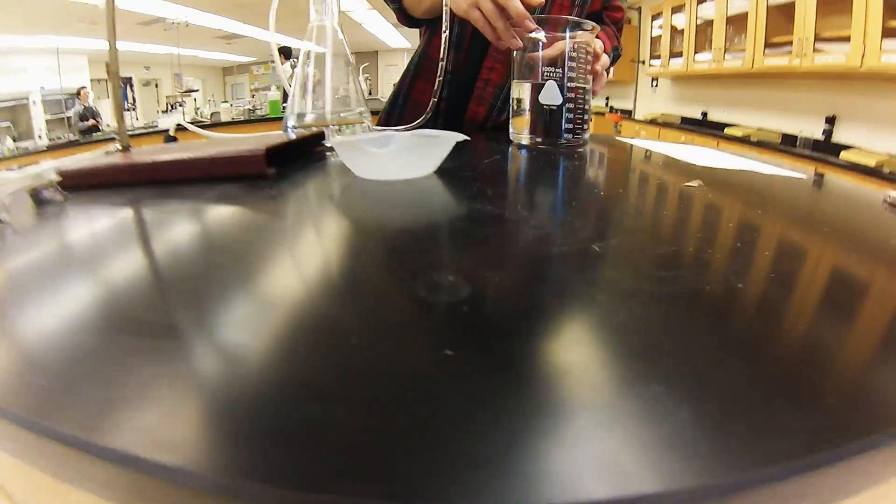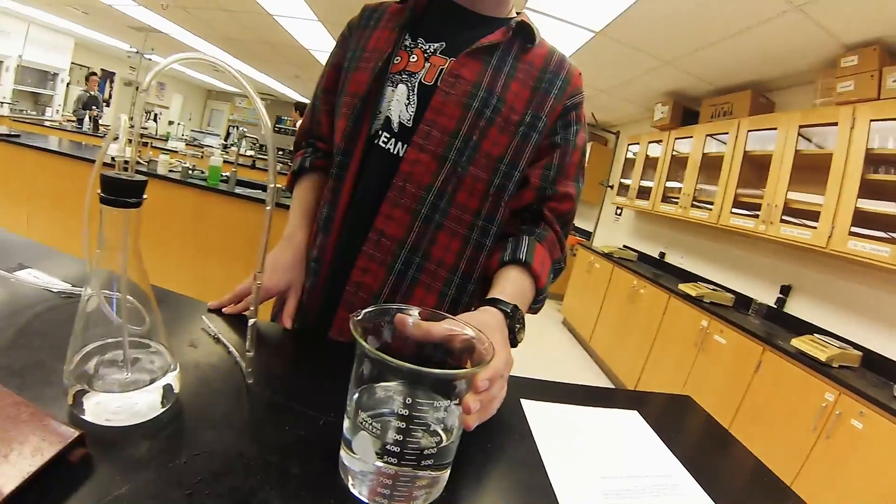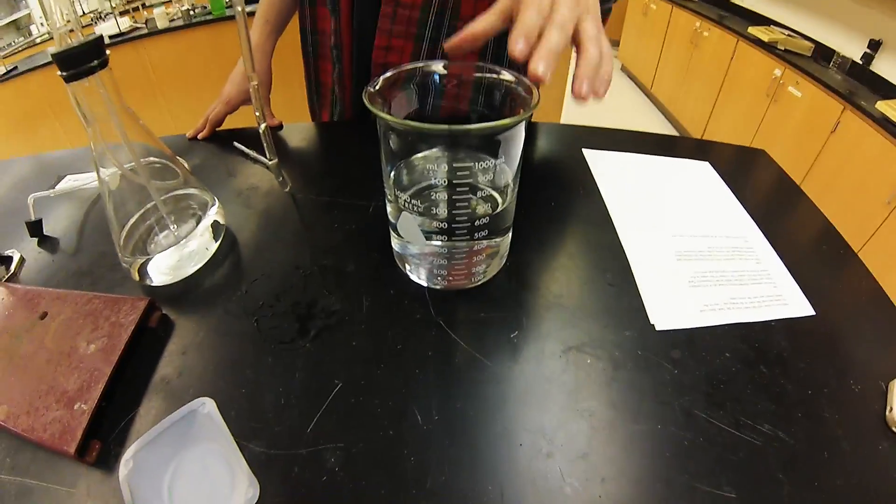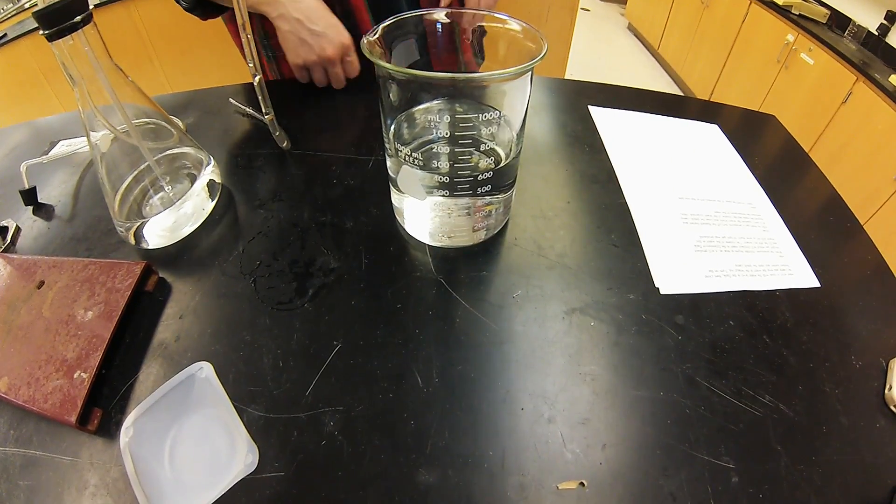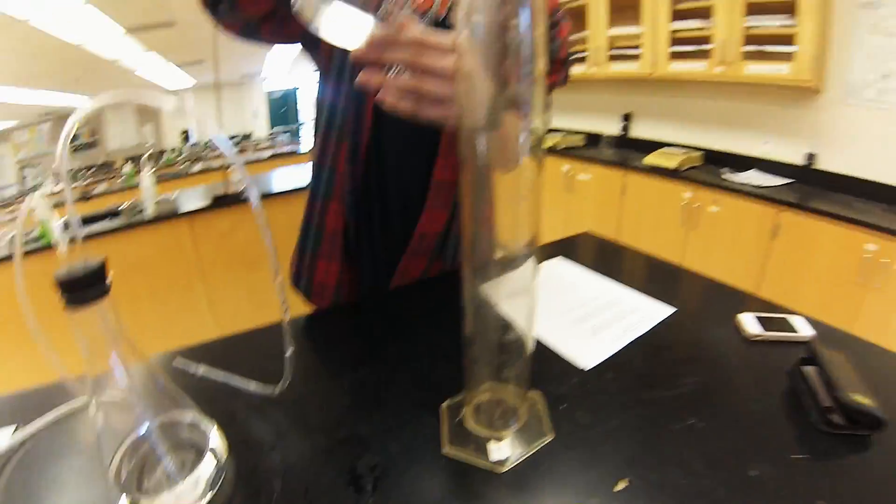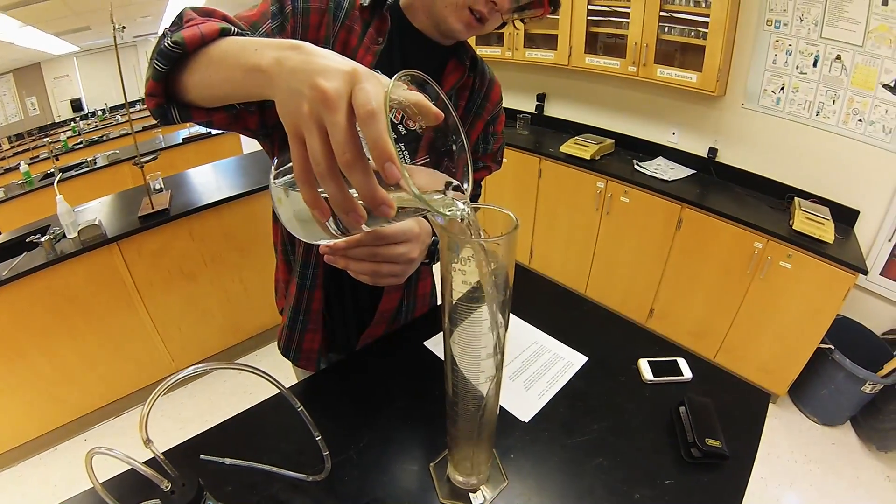This will be the total volume of gas displaced from the Erlenmeyer flask. We're going to measure this in a one liter graduated cylinder.